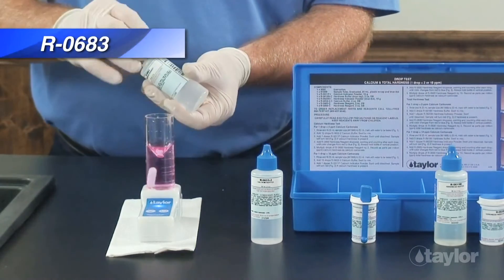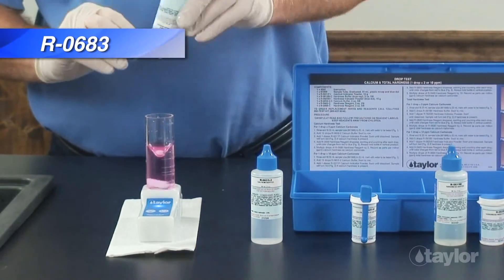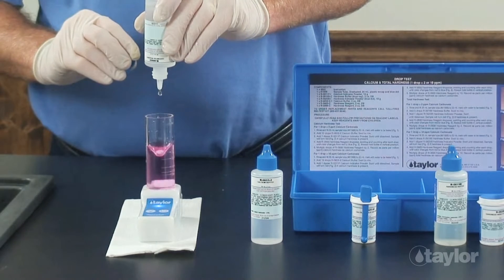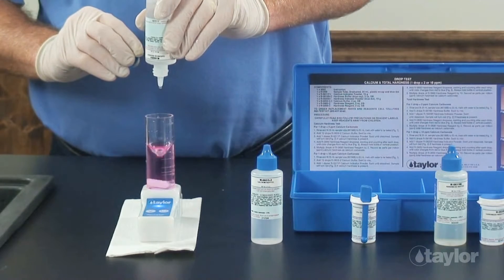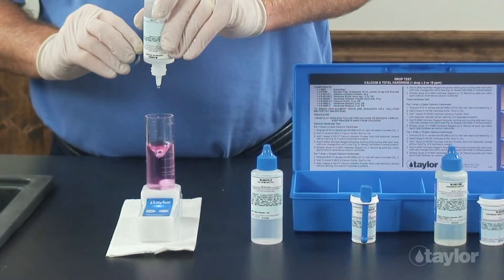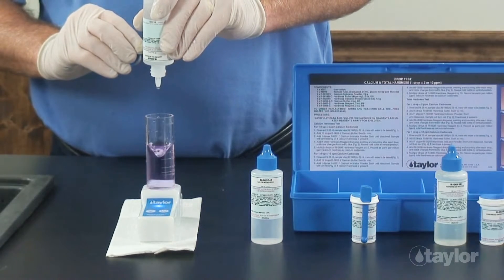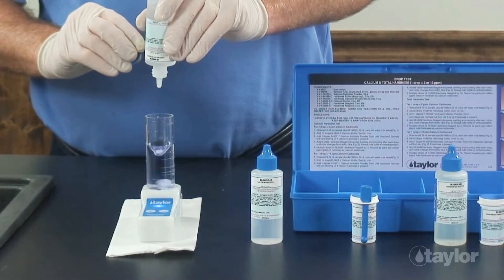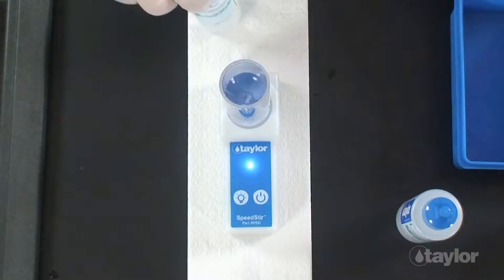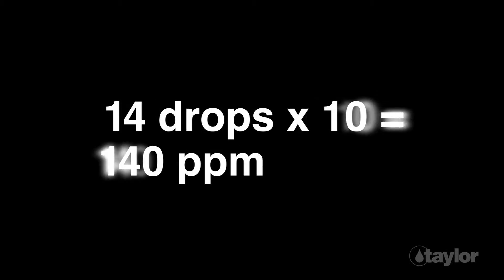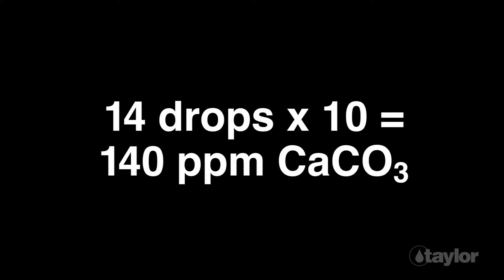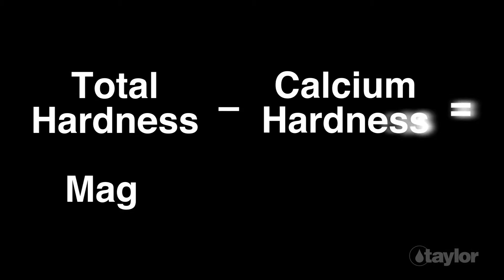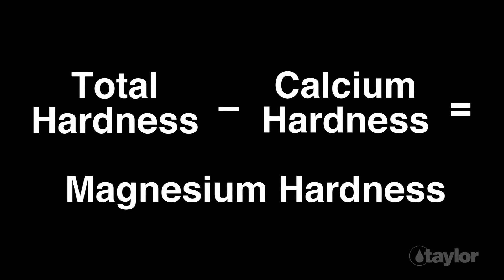Add hardness reagent drop wise, swirling and counting after each drop, until the color changes from red to blue. Multiply the number of drops of hardness reagent needed to reach the endpoint by 10 and record as parts per million total hardness as calcium carbonate. To determine the magnesium hardness in a sample, simply subtract the calcium hardness result from the total hardness result.